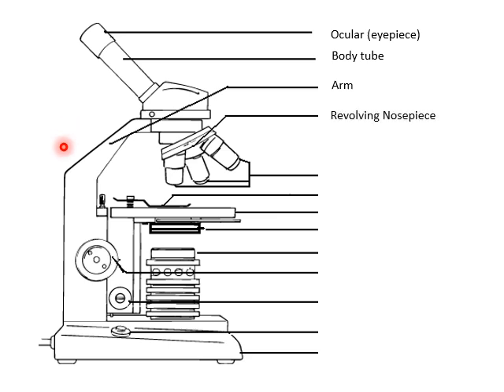So this here is a revolving nose piece. So you'll see on the microscopes, if you haven't used one before, you can't remember, this is going to turn so we can look at the different objective lenses that are here. And we've got a low, medium, and high objective lens. And that's what we're going to be using to turn as the revolving nose piece.